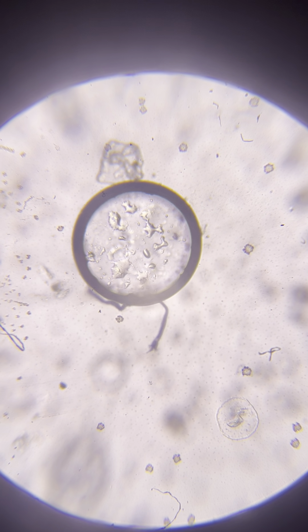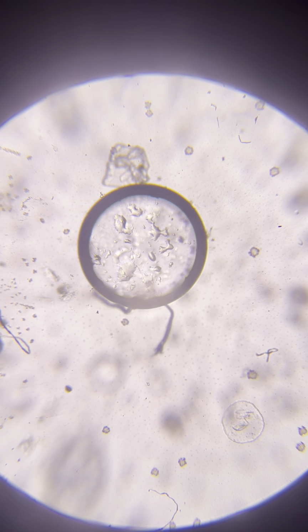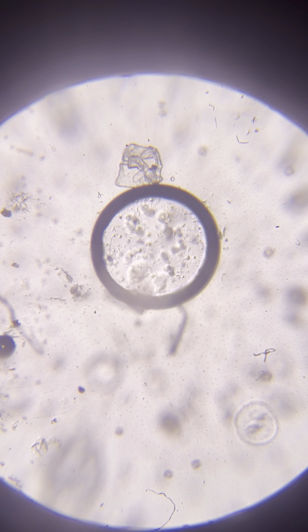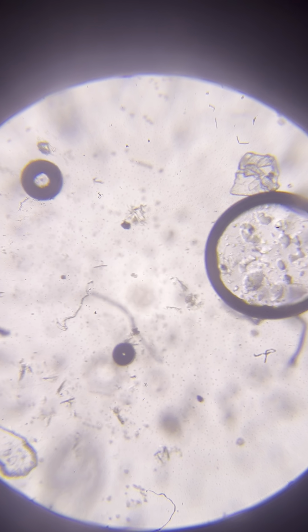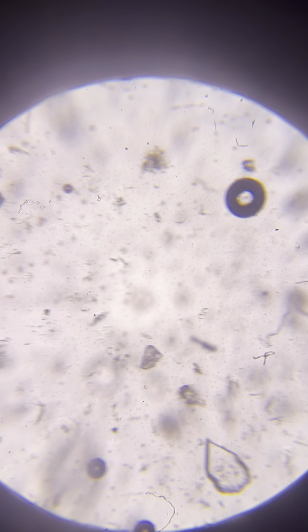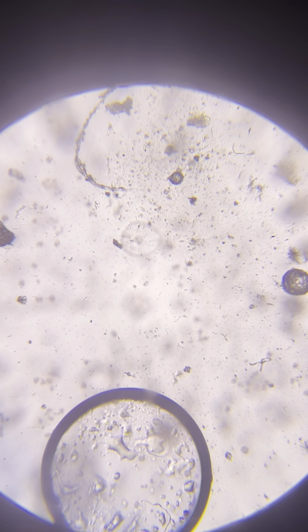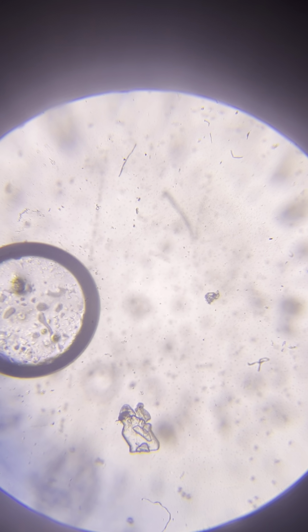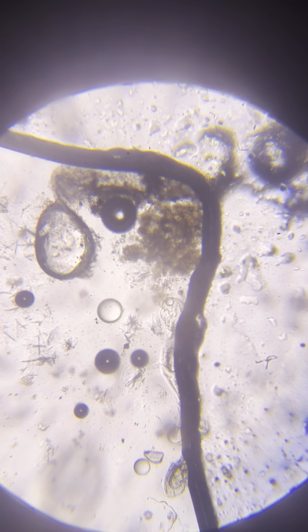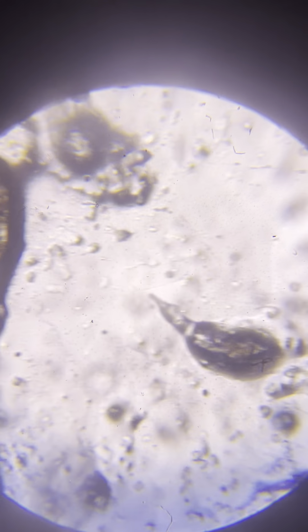Whoa, what a nice one. And of course with the Stargate property, you see really different stuff inside and outside. Wow, this is a great shot. And many others. Looks fine, impressive, all sorts of fat ones, thin ones, big ones, huge ones. Very nice. Wow, so many of them, and we've just started. So the sodium bicarbonate seems to have been a good idea.